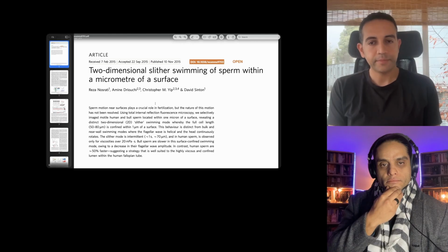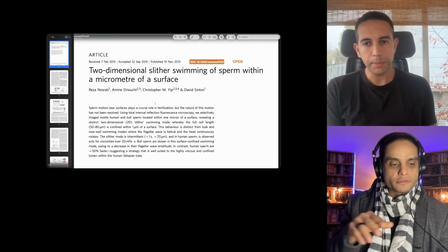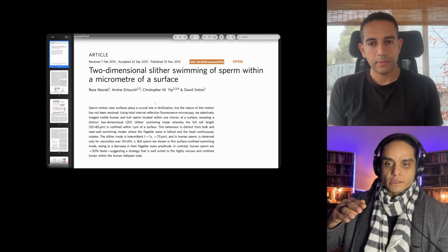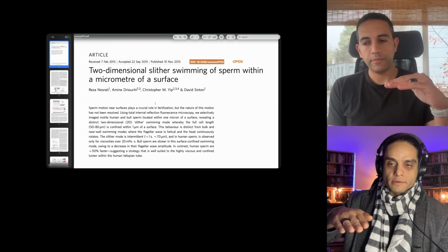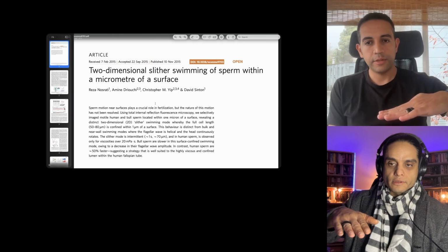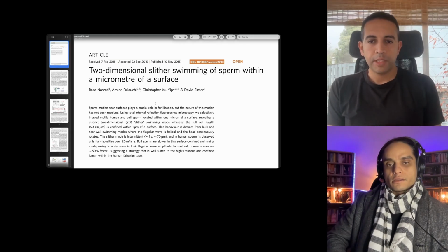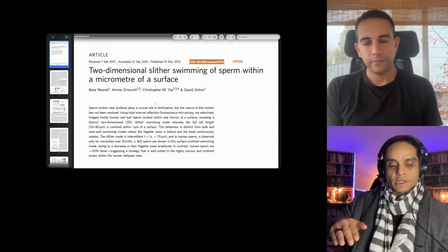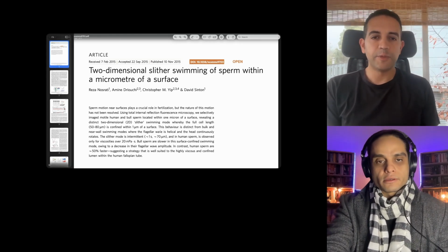Okay. So just to make sure I understood correctly, when closer to the glass, which means closer to the objective, closer to the surface, they move more like a snake. That's right. It's a snake-like motion, and farther from the glass, it moves more like a torpedo. Exactly.